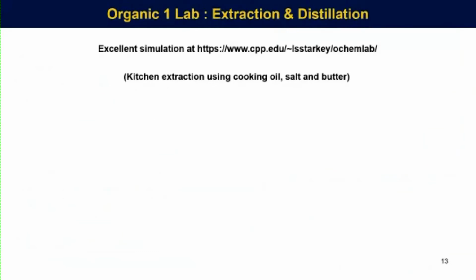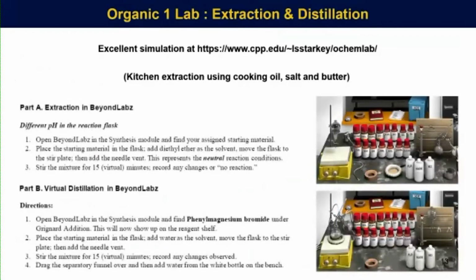So extraction and distillation, again, somewhat confusing, somewhat difficult to do online, but we did some kitchen stuff with cooking oil and salt and butter, and they reported this, and it was fun, and it was okay. But then we decided that Beyond Labs would be useful for getting used to for synthesis. So for example, in the extraction experiment, we've just borrowed from what we did with solubility.